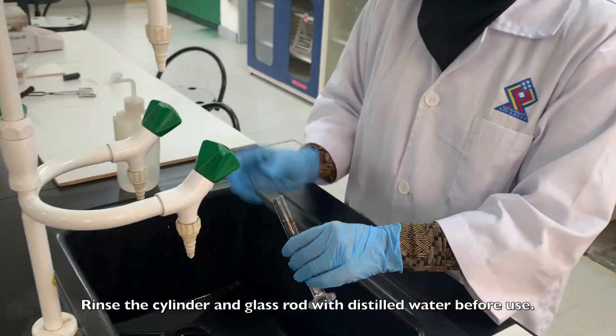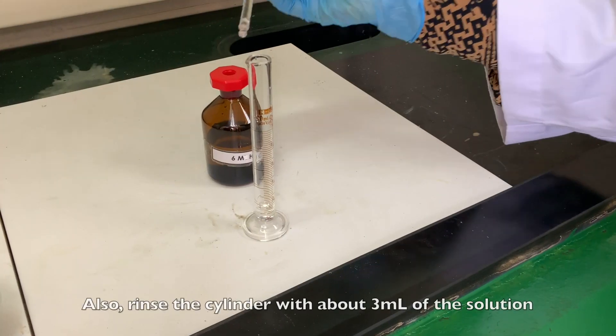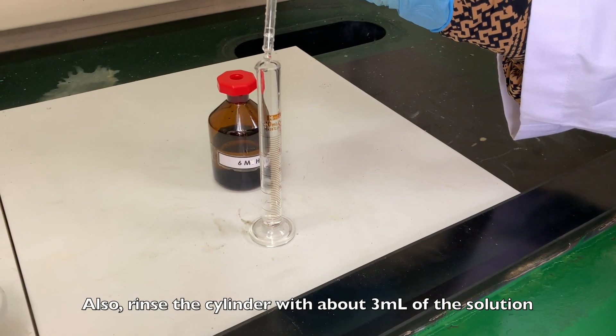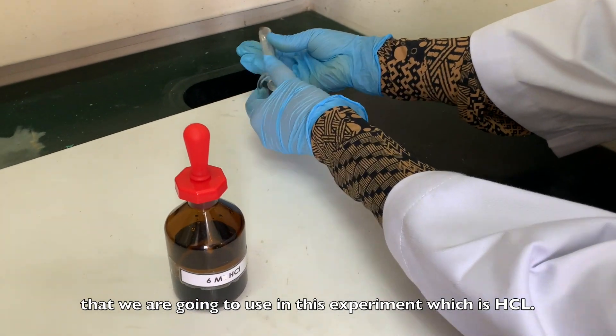Rinse the cylinder and glass rod with distilled water before use. Also, rinse the cylinder with about 3ml of the solution that we are going to use in this experiment, which is HCl.